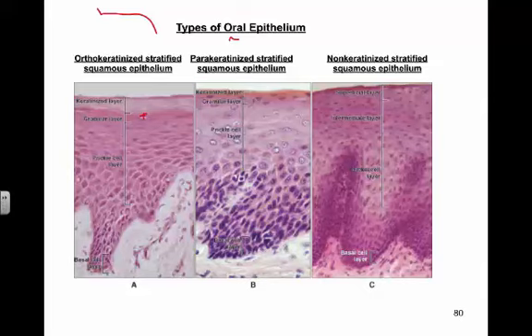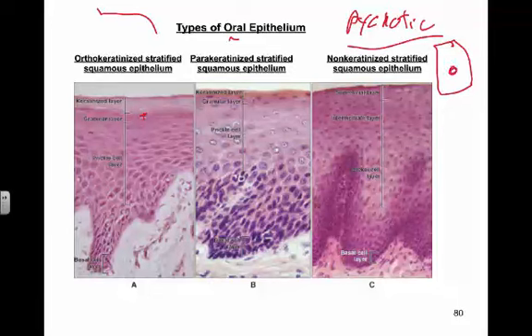We think it's an intermediate type of epithelium, but the top cells are different. In the top cells, the nuclei are visible. They're pyknotic nuclei. Pyknotic nuclei are, when you take a look at a cell, very dense and very dark and very round. They're dead.